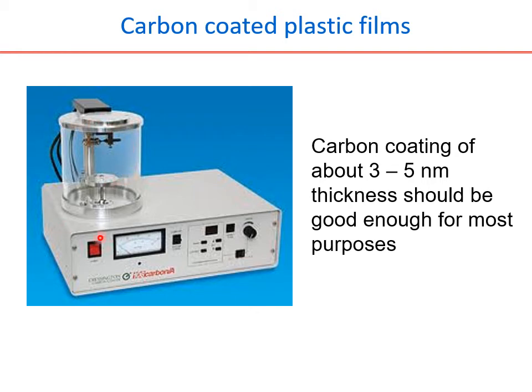Now when you continue the experiment and the carbon film starts depositing, the place where wax is applied will prevent the deposition of the carbon film, and the place where the wax is not applied will start accumulating it. So that means you have a contrast between carbon coated and carbon free surfaces.